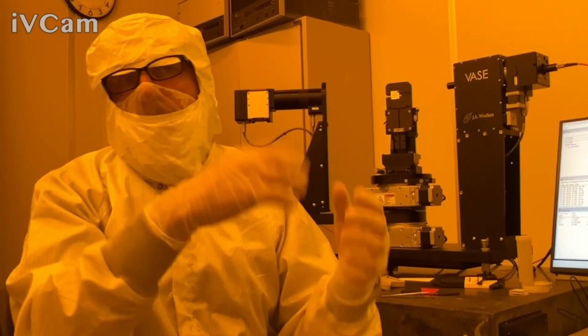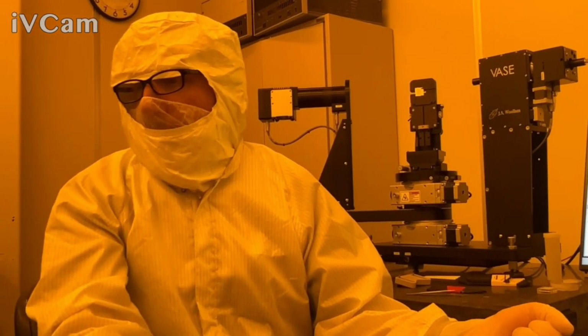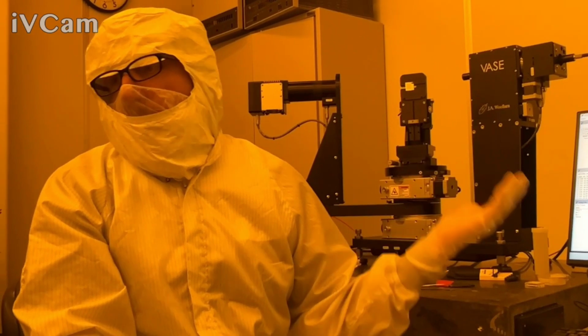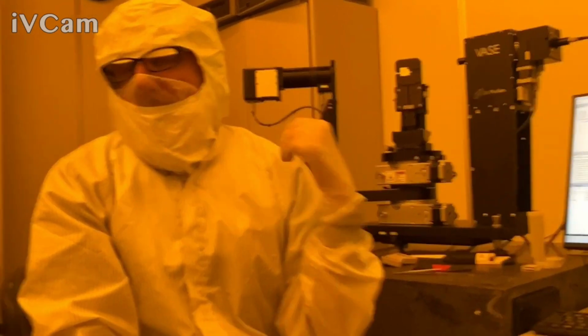There are plenty of papers out there correlating ellipsometry-determined roughness with AFM or whatever, right? But it's sample dependent whether it really has it. So again, if you have a sample that has roughness, I'd say just measure it, and then you can see if it correlates.